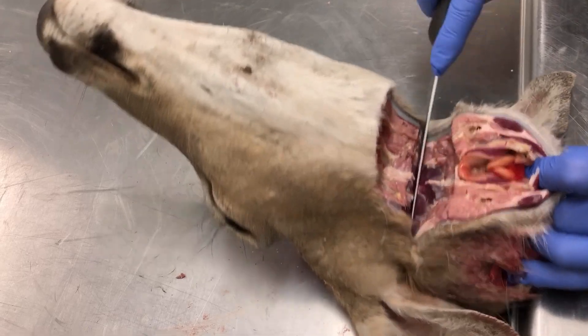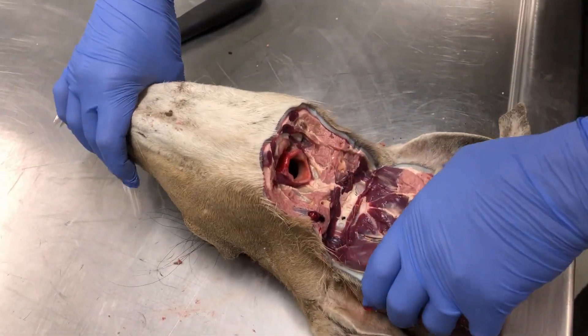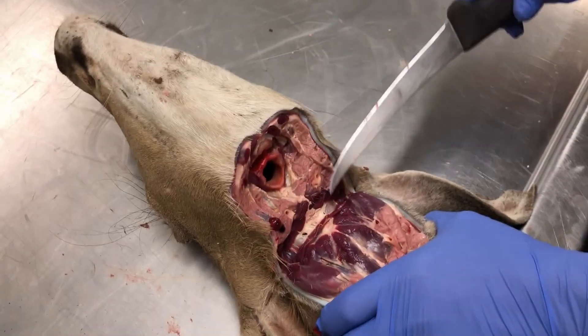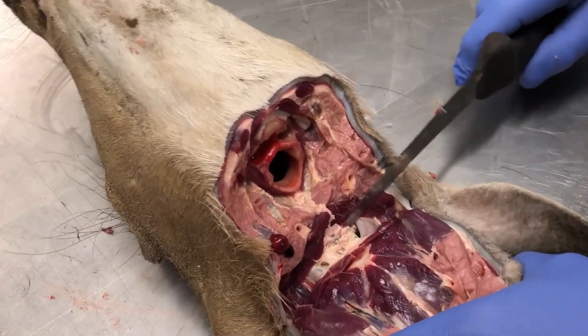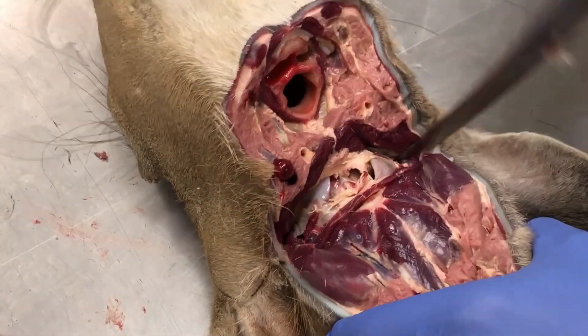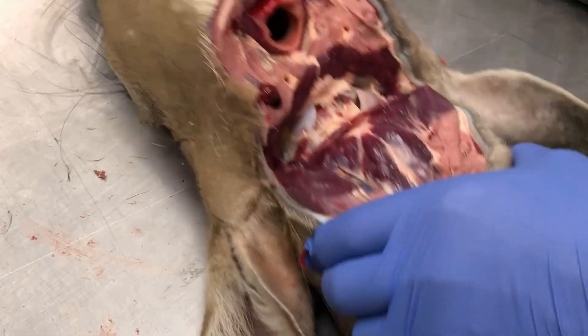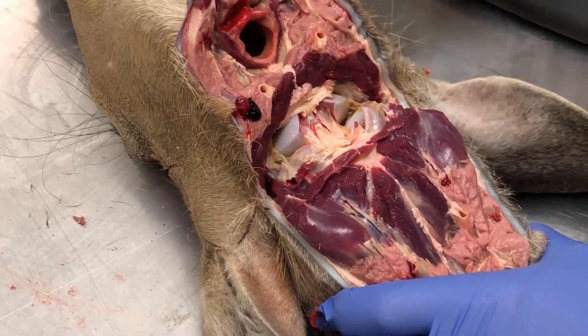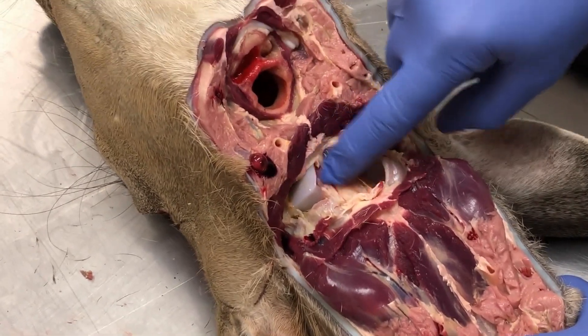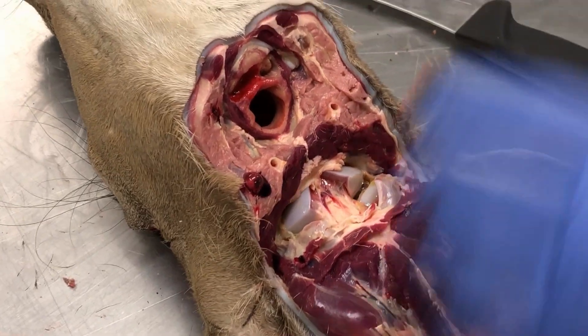Go back a little bit and then down. And you should come to the occipital condyle joint, or the foramen magnum, which is basically the opening of where the spinal column goes into the brain. And we just loosen that up. So here's the OBEX right there — that's a tissue that we may collect on some samples, but we're not going to go there this time.